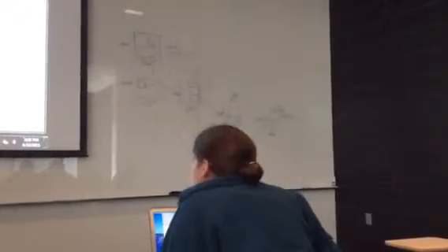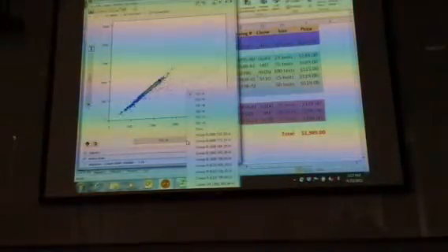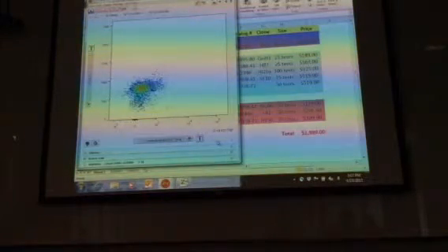If we just double click on the 34 positive, CD38 negative here, and then what we're going to do is look at CD90 and CD45RA. So the CD90 PE is 488, 575, 26. This one.